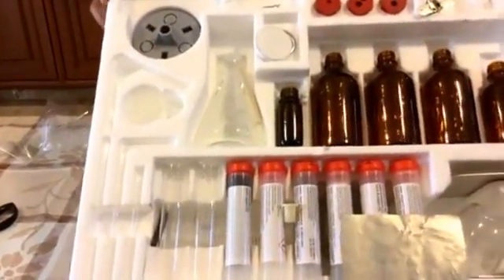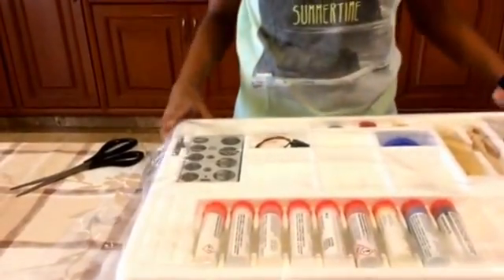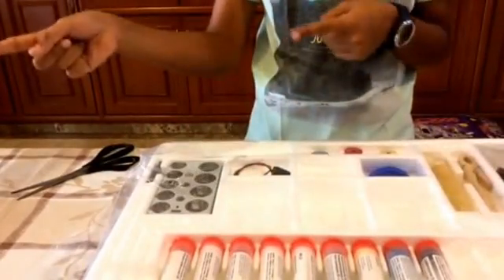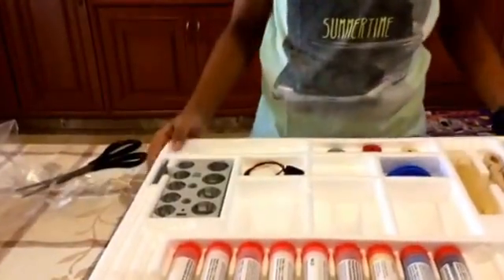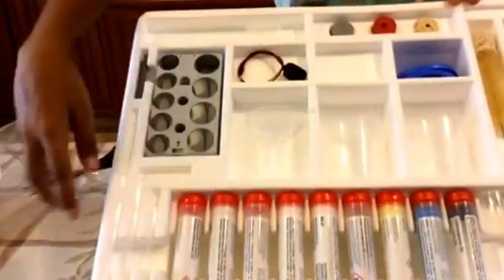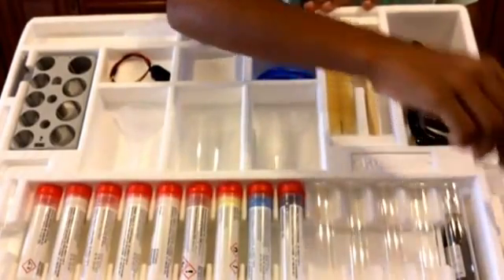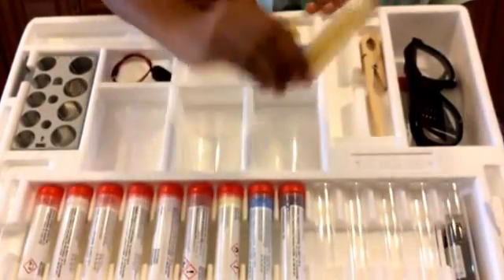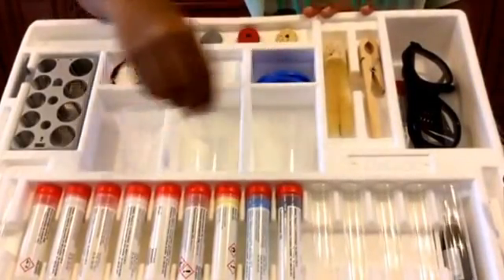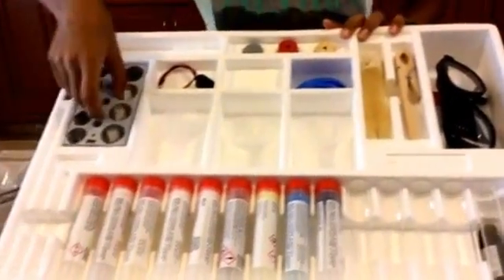Okay, so that was the first compartment. This is the second one. We have some chemicals again, some rods, some test tubes — that's what everyone's waiting for — a spatula, some safety goggles, some coils, a plastic funnel, and a test tube stand.